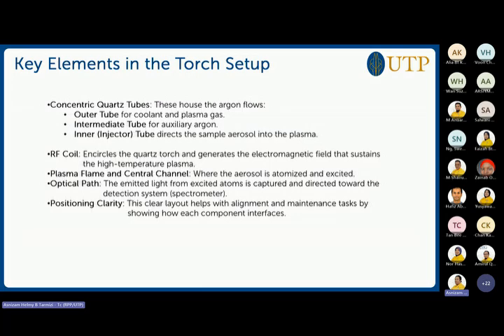Positioning clarity. This clear layout helps with alignment and maintenance tasks by showing how each component interfaces.